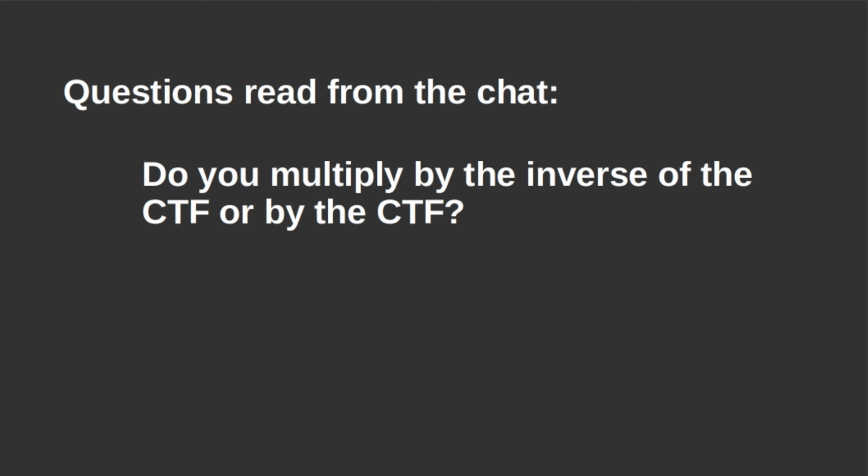So this was one of the things. And novaCTF has this additional defocus file parameter where you can say, okay, I know that this estimated value is shifted by 200 nanometers because it's at the carbon and not in the middle of my densities. You can fetch this information into novaCTF to recompute the proper center of the estimation.